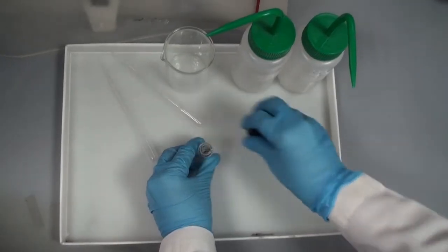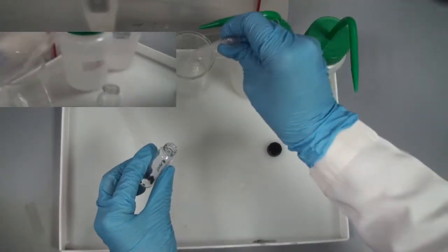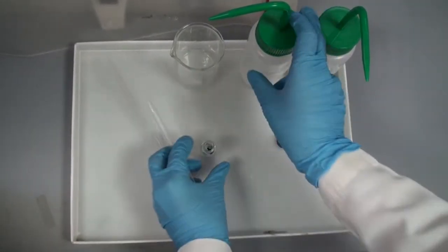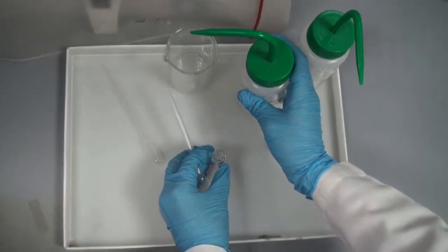Now we will do the dehydration step. We will start with 70% ethanol. First we remove the PBS, then put 70% ethanol and leave it for 10 minutes, then remove it again after the 10 minutes.